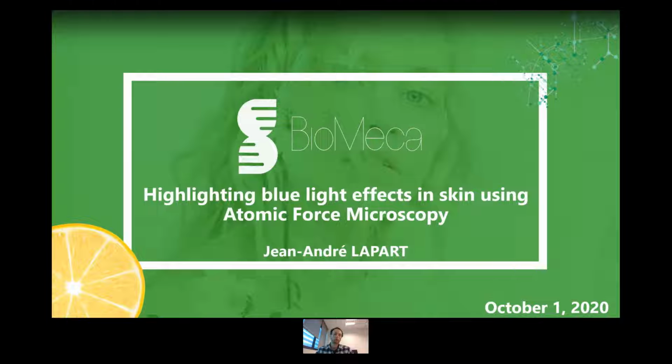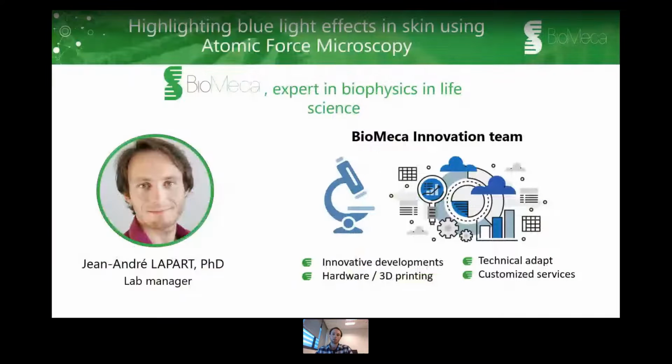Today, I will speak about how to highlight the effects of blue light exposure in skin using atomic force microscopy. So to begin, I would like to introduce myself. I am Jean-André Lapart, and I am the new lab manager at BioMeca.